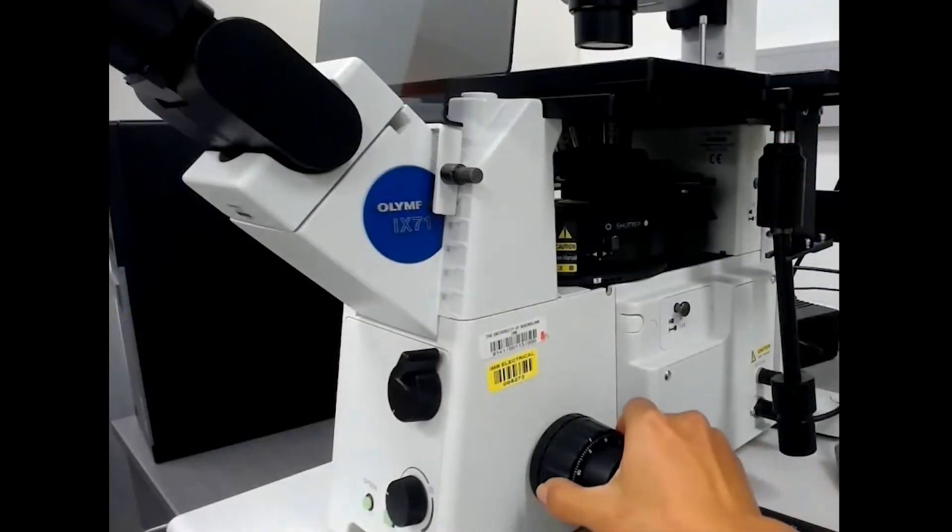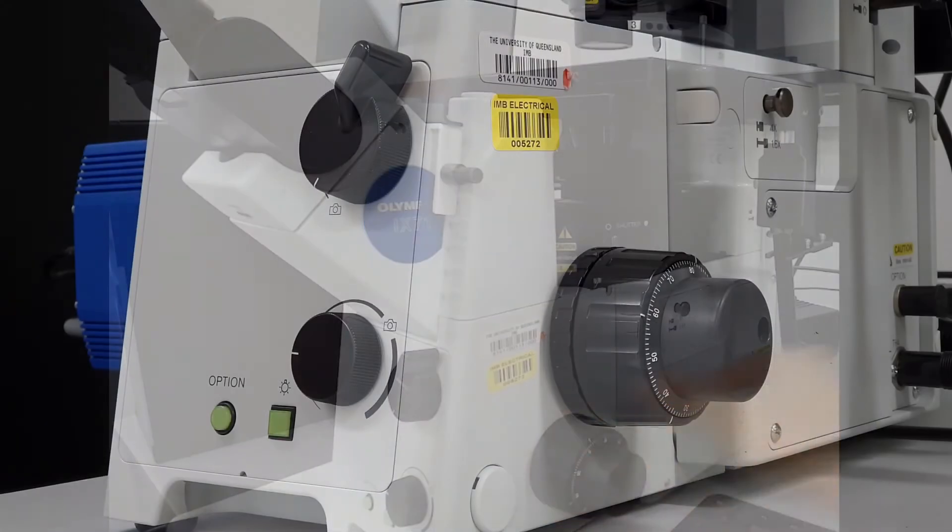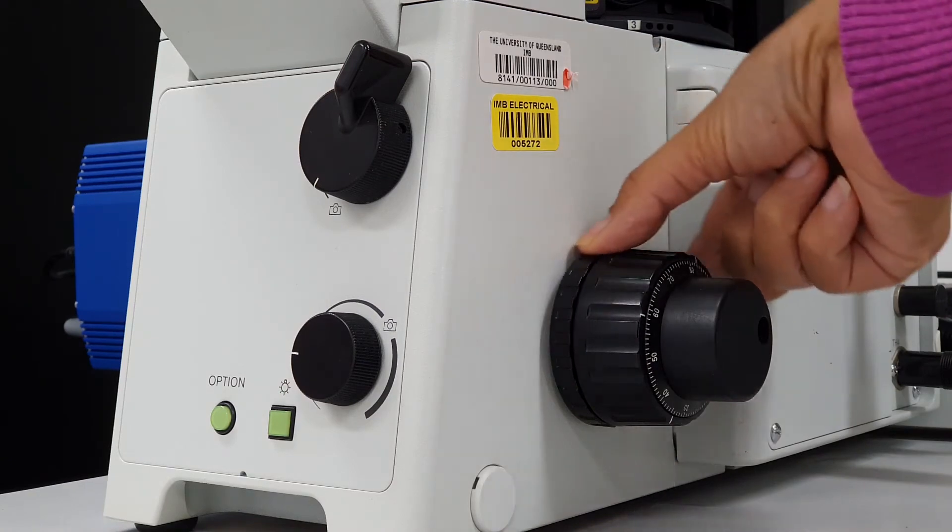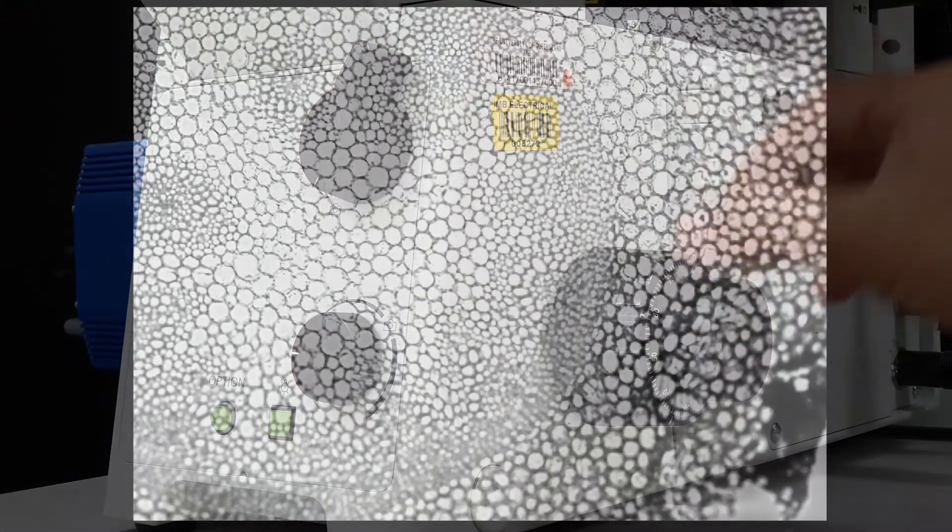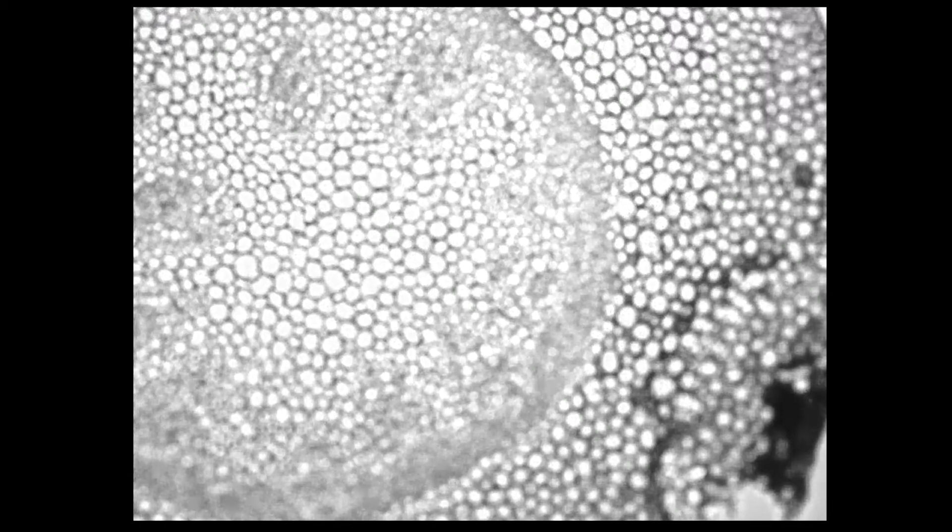If the focus wheel is hard to turn, you may need to loosen the innermost ring on the focus knob. However, if you loosen it too much, the objective may slip and lose focus unexpectedly.